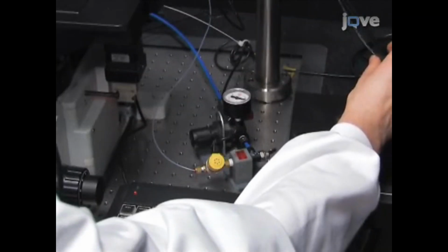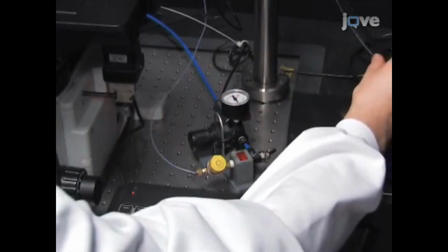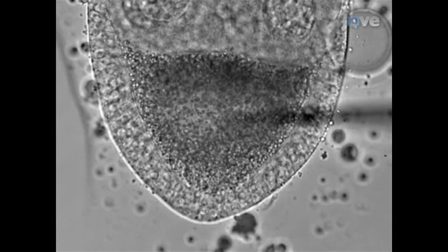The precise amount of fluid injected is difficult to quantitate. To increase the injected volume, either adjust the pressure or duration of the injection pulse, break the needle tip to increase the needle opening slightly, or simply use multiple injection pulses.